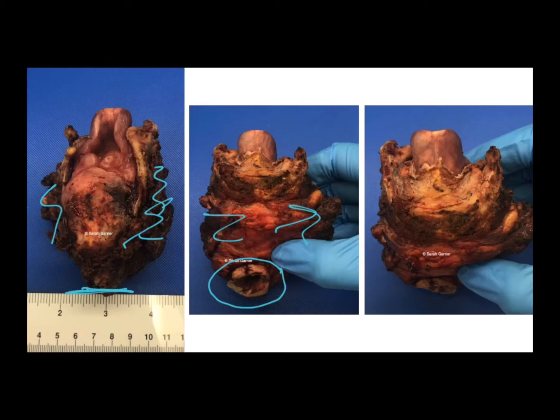So depending on the tumor location and size, these are fairly common in people with laryngeal cancer. This is a tracheostomy site, and so you definitely want to get a section of that. Some people prefer you to take a full margin all the way around that, but I know that's institution dependent, so just keep that in mind. And if you have a tracheostomy site, you always want to mention it and section it.